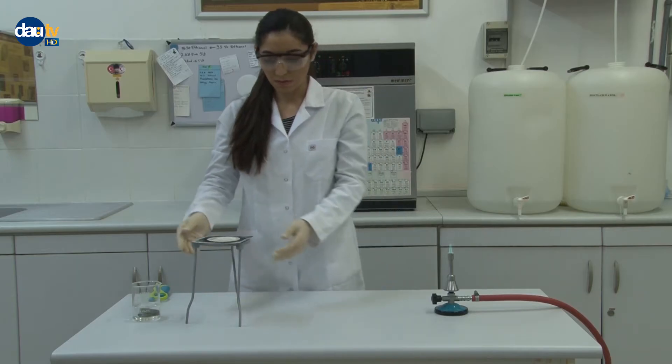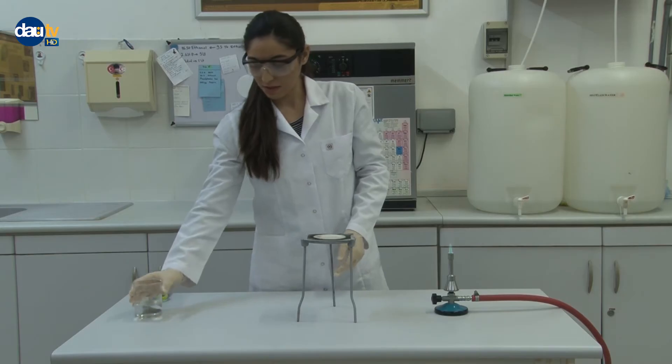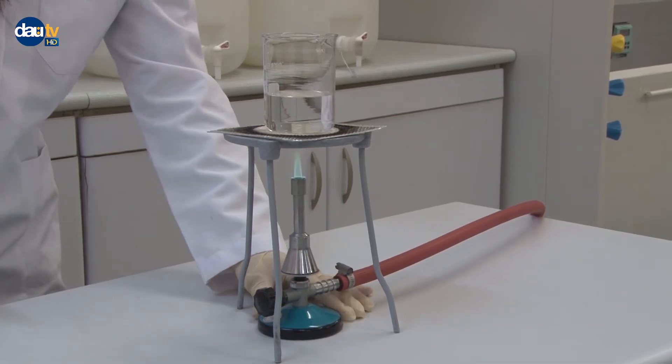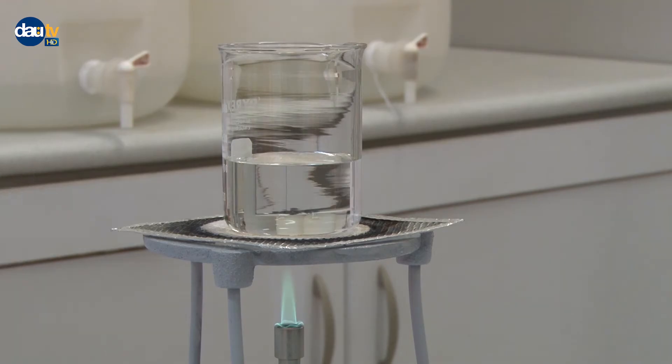Heating a liquid in a beaker by gas burner. Place a 250 milliliter beaker one half filled with water on a wire gauze or clay triangle resting on a tripod. Light your gas burner and adjust it to produce a blue flame. Place the burner beneath the wire gauze and heat until the liquid boils.